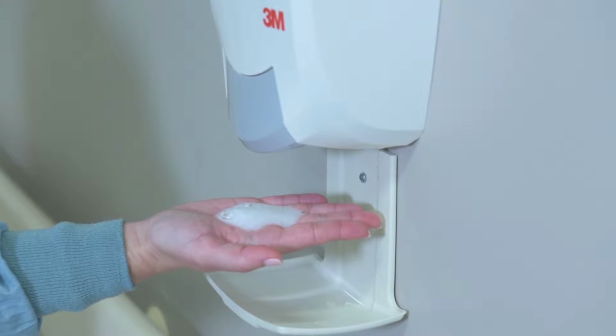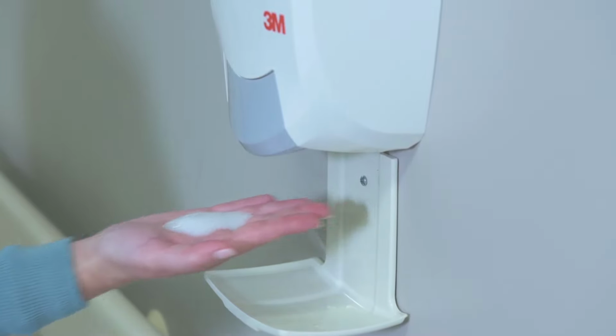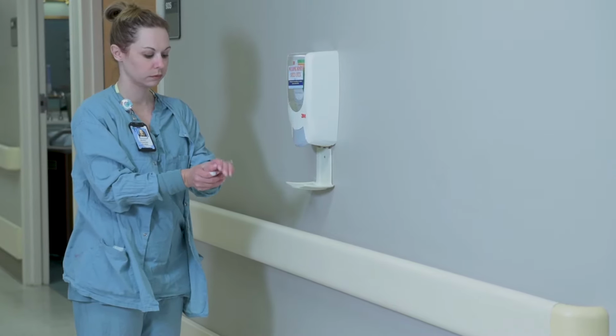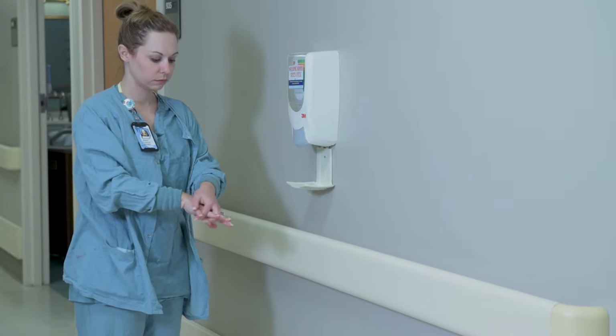Apply product to the palm of the hand. You need a quarter-size puddle if a gel product, or a golf ball size if a foam agent. Rub on all surfaces of hands and fingers to include web spaces until completely dry.